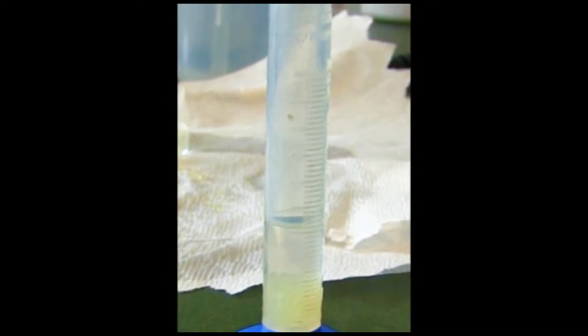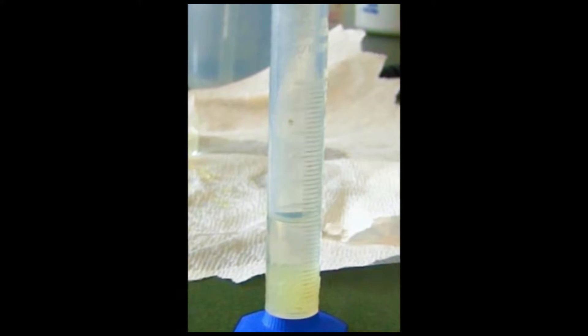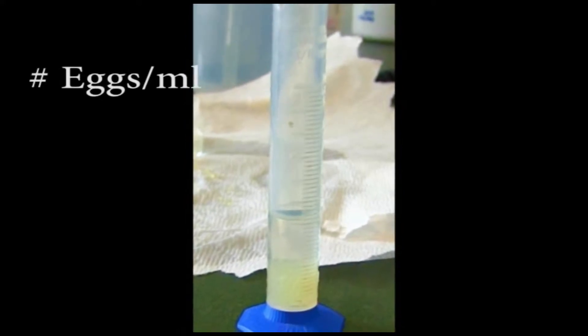Count the amount of eggs it took to raise 1 milliliter of water. Repeat this 2 more times to get an average. This average count is the number of eggs per milliliter.